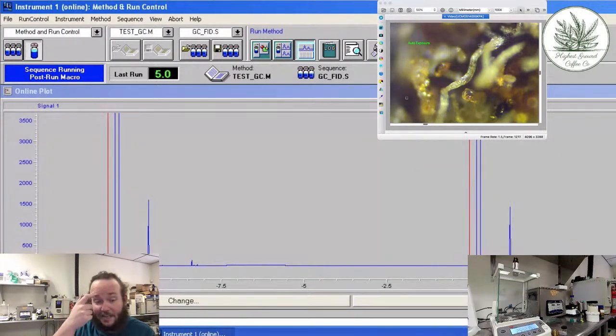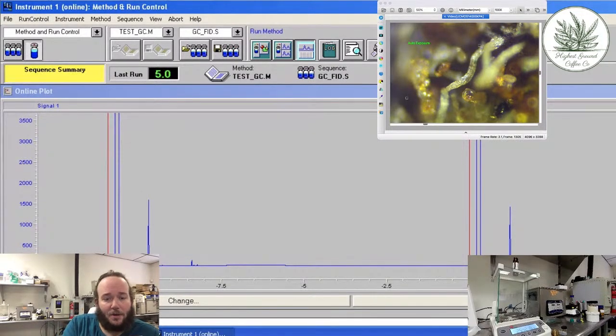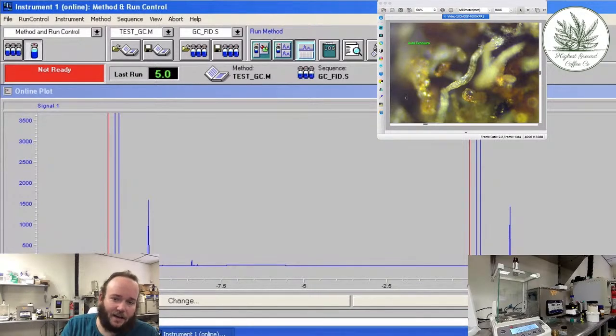And if that's the case, they'll have to be rerun, but I won't be able to tell that until the sequence has finished running and I pull the data over to another computer, which is a little newer in software, but not by a whole lot. But that computer will be the one that we use to actually quantify the data and make sense of all the results, essentially.